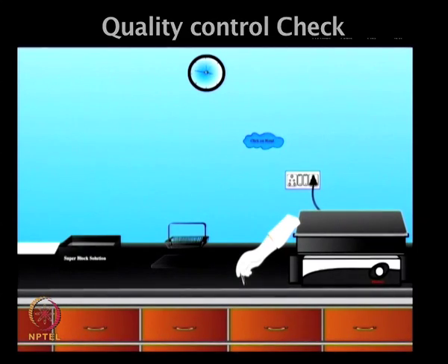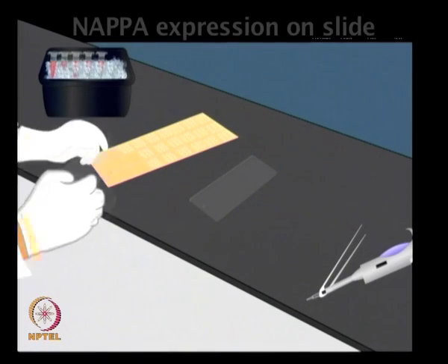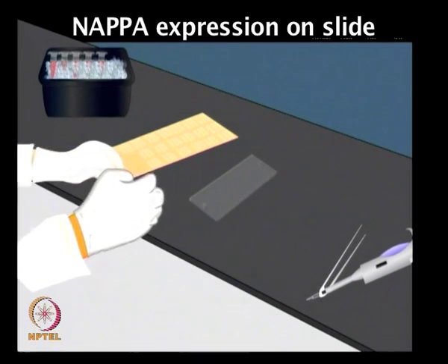Block the chips with the super block for an hour, and after blocking is done, then we can use the PicoGreen mix to place on these printed slides.